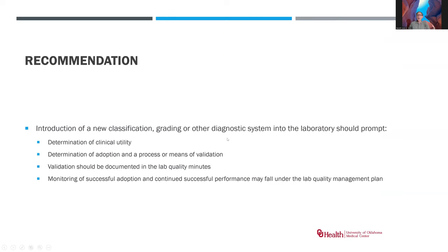So my recommendation is that if you're going to introduce a new classification, grading, or diagnostic system in a laboratory, you should determine the clinical utility. You should think about how you're going to adopt that and roll it out and how you're going to validate it. That validation should be documented in your minutes, and you should monitor that adoption to verify that you have actually successfully accomplished what you said you were going to do.